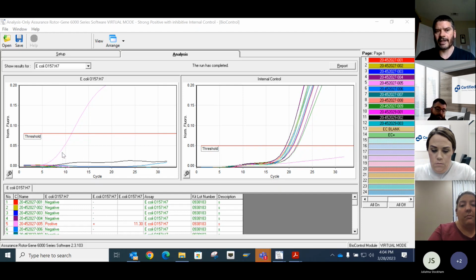So you don't need many cycles for that level of fluorescence for that probe to attach for it to cross the threshold. That's where we see more impact on the IC with positives, in the Listeria assay, but you can see them in any assay. The enrichment time is just so much shorter for E. coli. We don't usually get to those cell counts. Does that make sense?